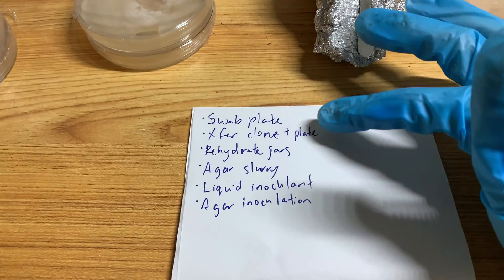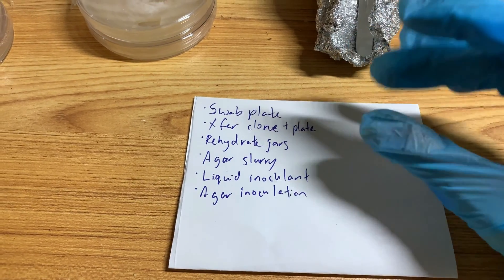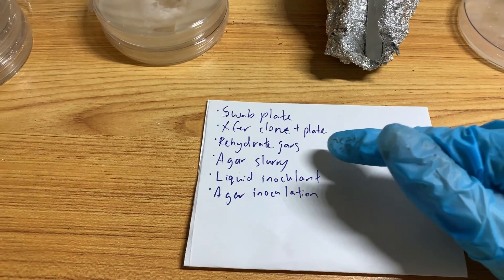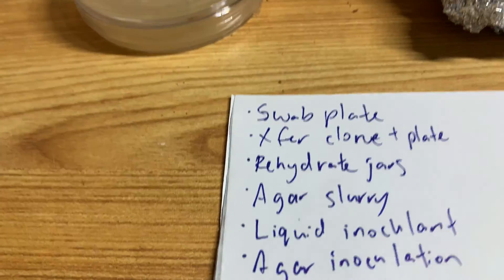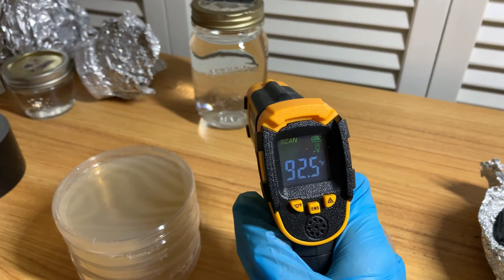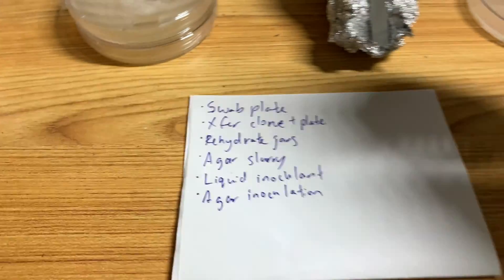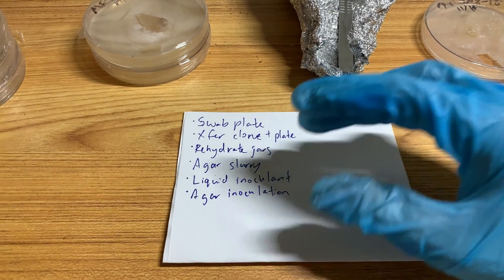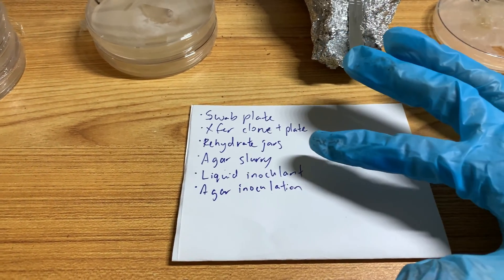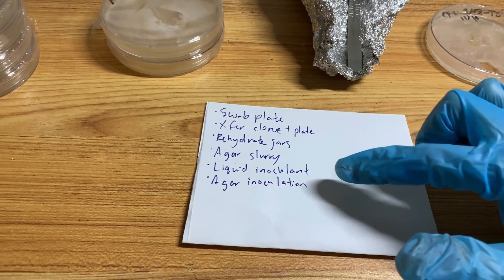Today I'm going to be swabbing five plates with this swab, and then I'm going to be transferring a clone plate and another plate — basically making two transfers. Then I'm going to rehydrate the jars. The water I was going to use for that is still a little high in temperature, so I'll probably do that last. I've got about five jars I want to rehydrate, and we also have 10 jars that I'm going to be doing agar slurry, liquid inoculant, and agar inoculation with.